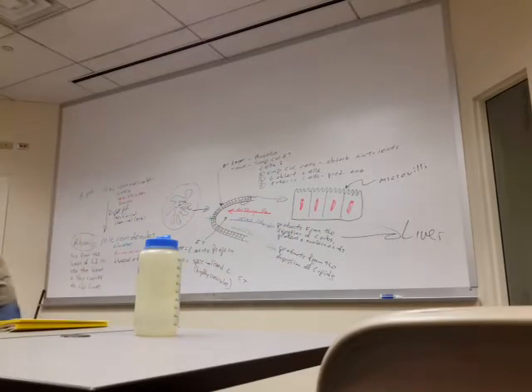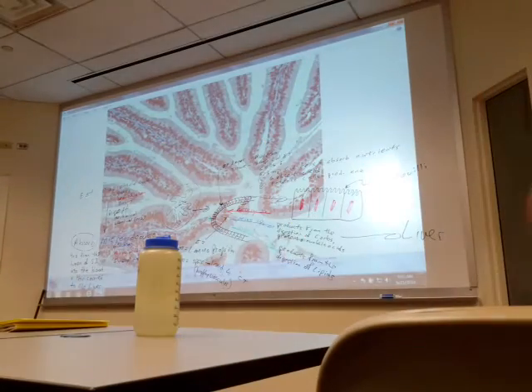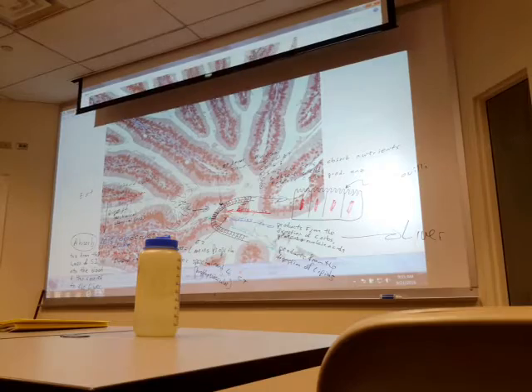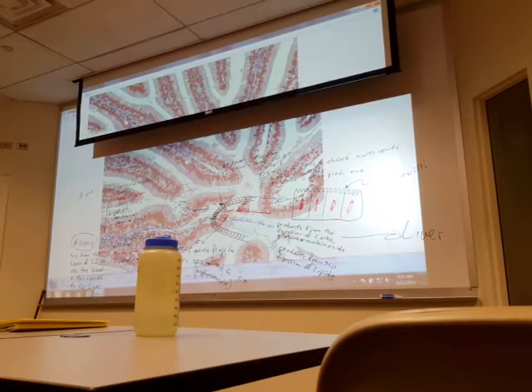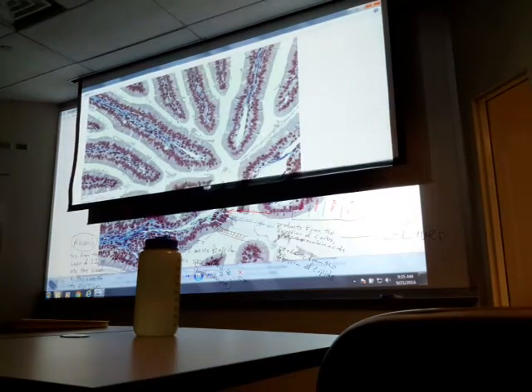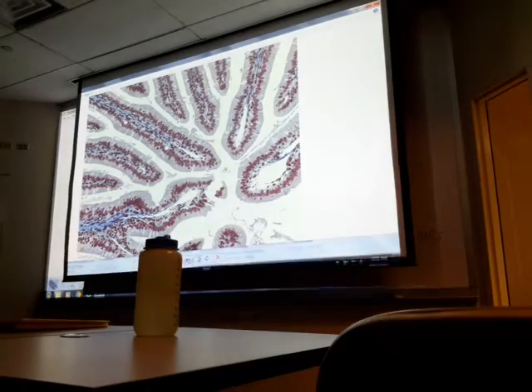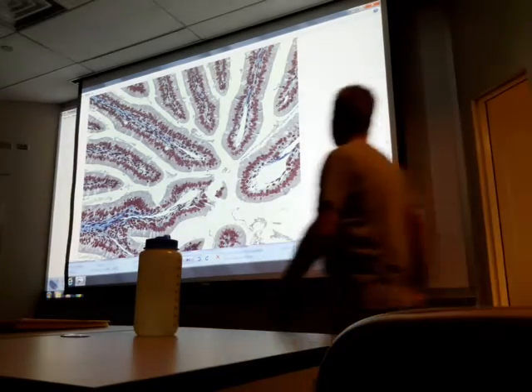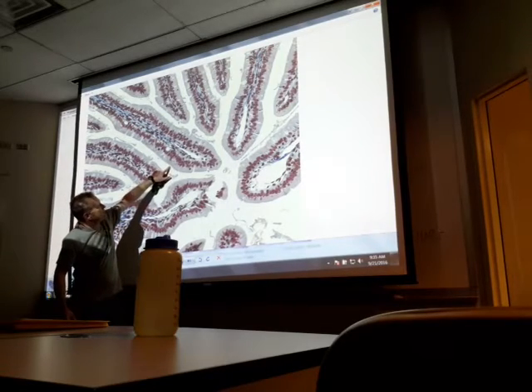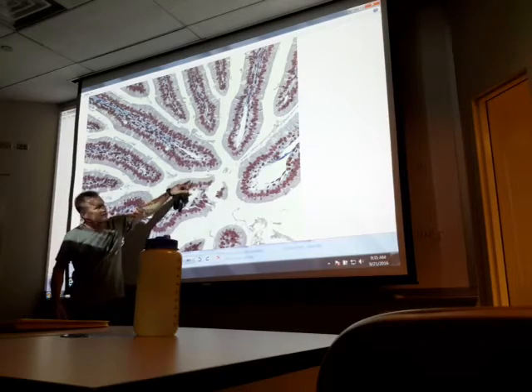We won't see the microvilli, but we'll know it's there, and we call what we do see, anybody know? Brush border. We call it the brush border. This is just an intermediate magnification, but we can still start to get a feel for it. This is just a little darker right along its free surface.